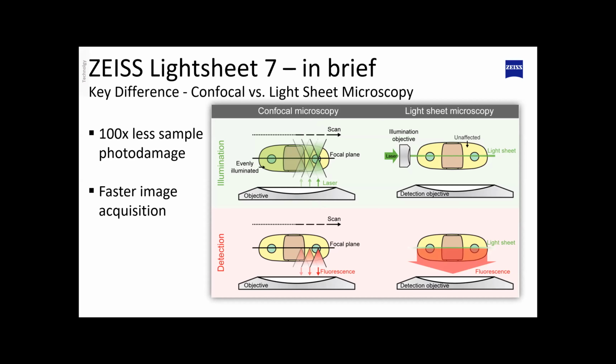So we basically have this decoupled, orthogonal angle. And that allows us, from the side, if we have a detection objective that's large enough, to read out a whole section of the illuminated object at the same time. So you're fast and you're selective in terms of illumination.